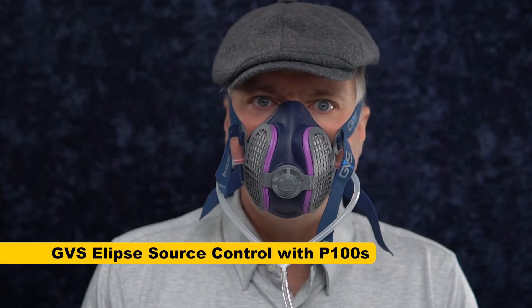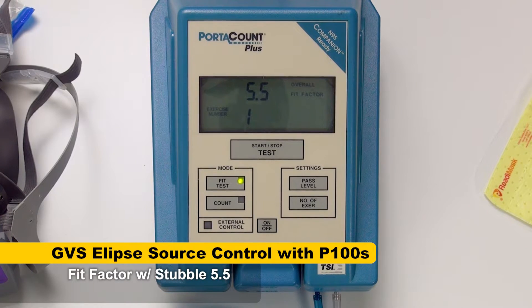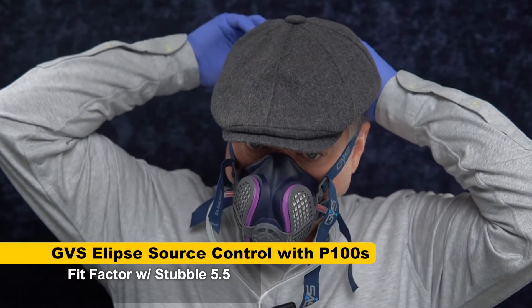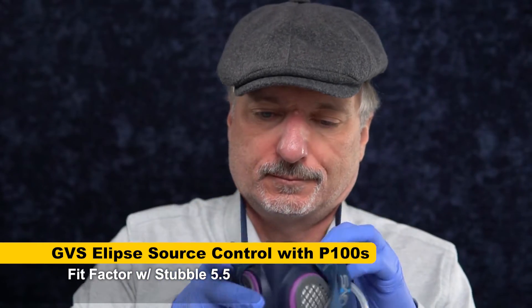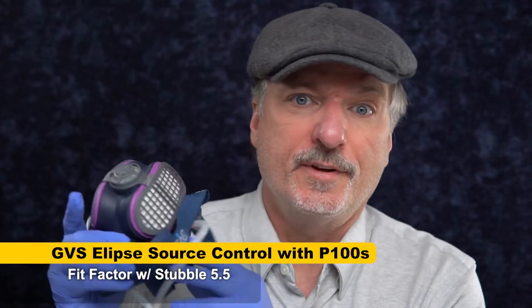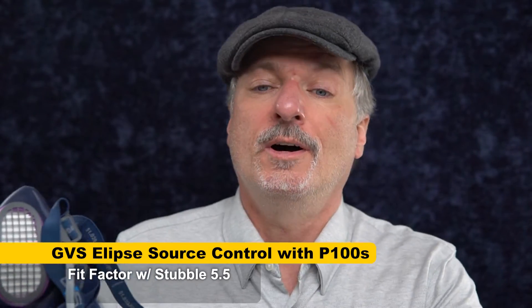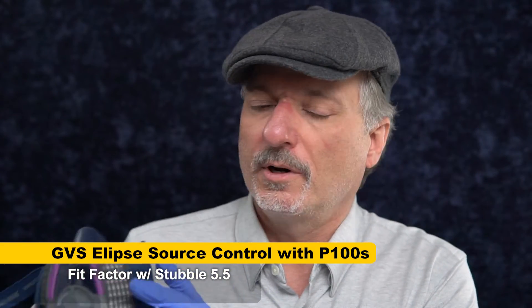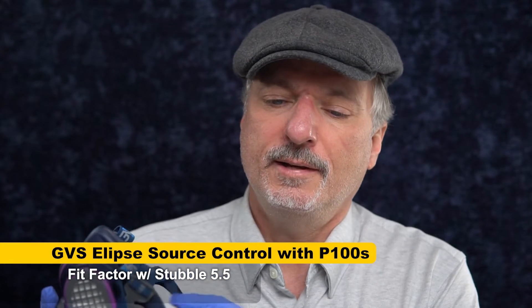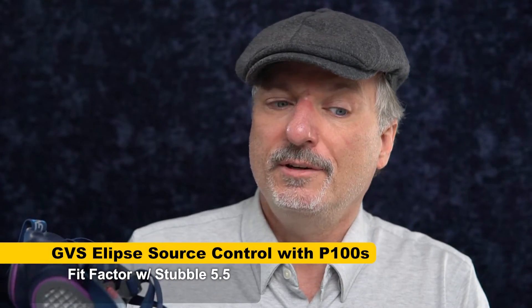I think I can feel a leak at my chin. The overall fit factor is 5.5 — that's bad, that's really bad. This mask is NIOSH approved and it's a professional mask. It's going to fit some people really well, but it does not fit me. The 3M didn't have any problem with the stubble and I got a great fit factor. But if you're wearing a P100 and need P100 filtration and you get a leak that takes you down to a fit factor of 5, meaning the air is only 5 times cleaner inside the mask, you don't get any of that benefit. Whereas with the 3M that fit me well, I had air that was 5,000 times cleaner on the inside.